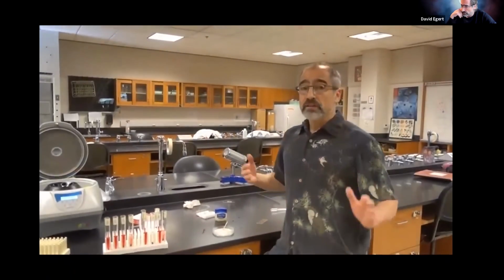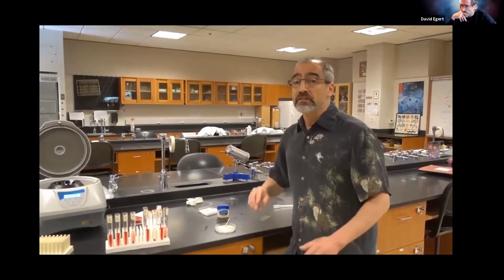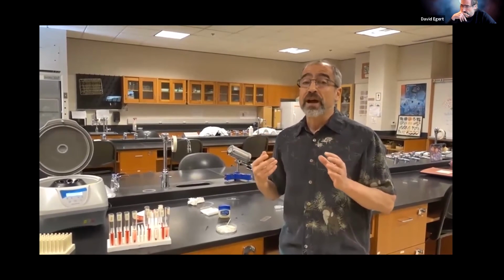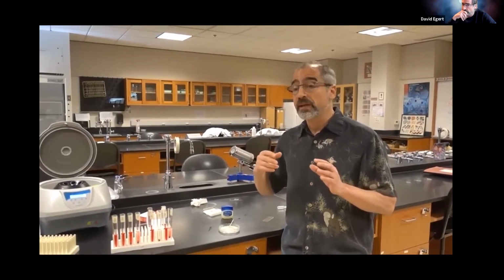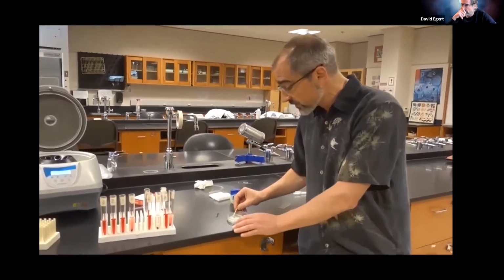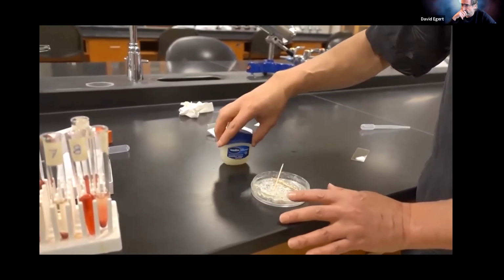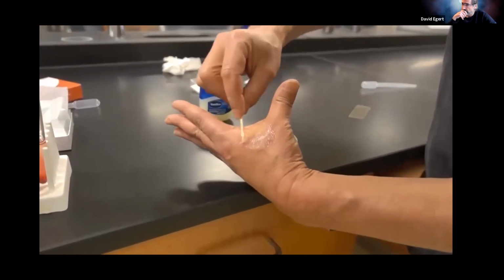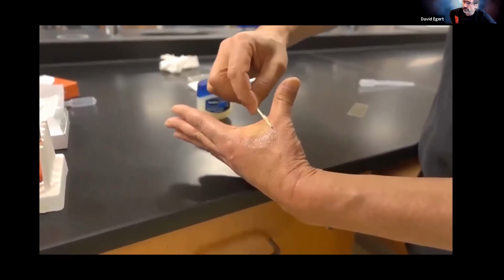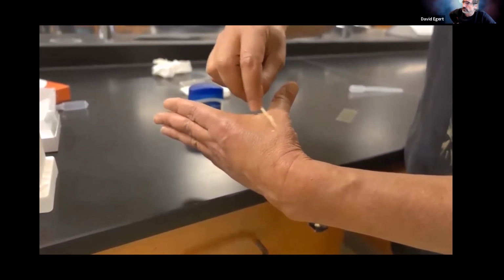All right, so to make a wet mount of the blood to see what happened to it, we want to make it so the cover slip is sealed, so the water doesn't evaporate from the solution if it just sits there. And so there's a nice little technique to make a sealed wet mount using Vaseline. This is just regular old petroleum jelly, Vaseline. You take a bit and you make a thin layer across this webbing between your thumb and your forefinger. It should be thin but present.